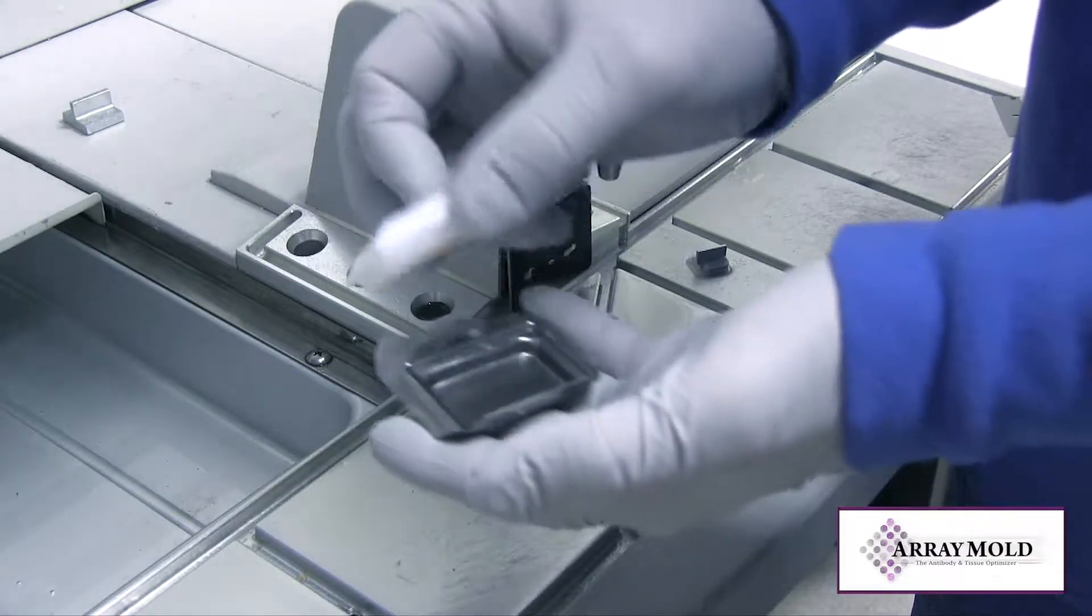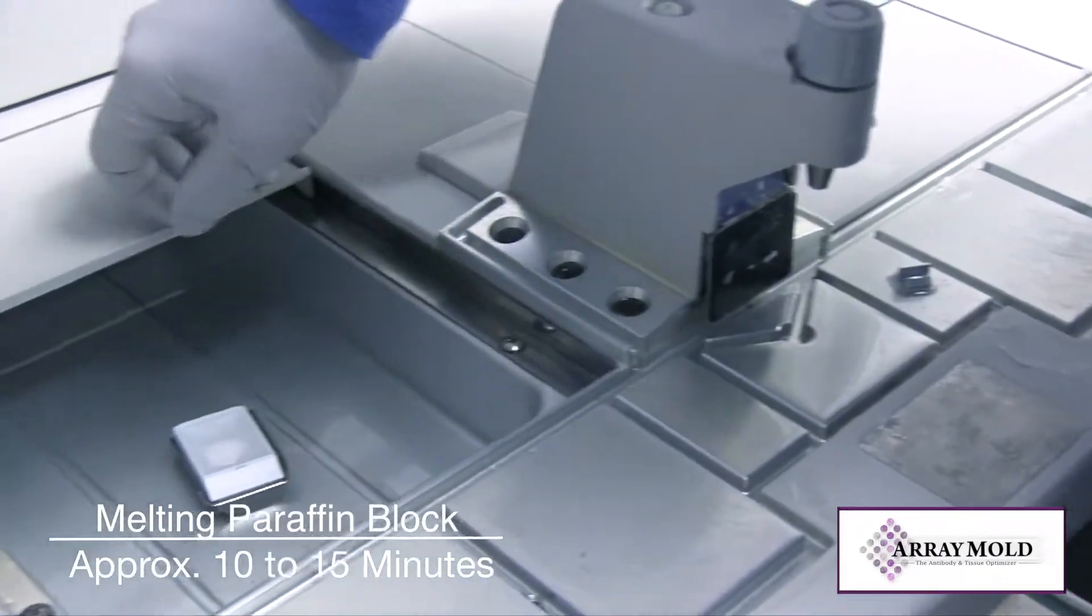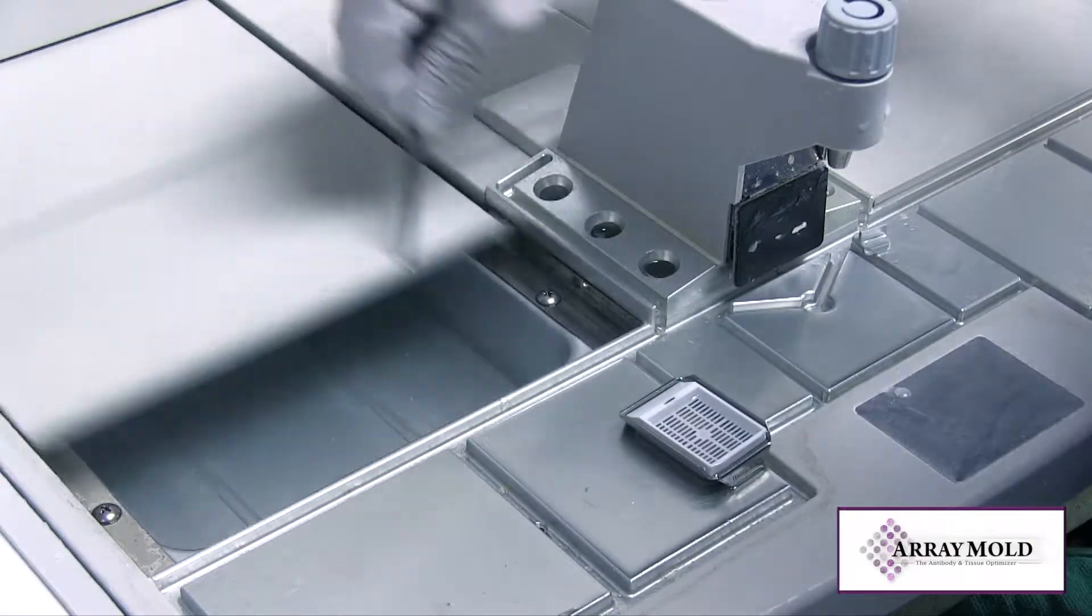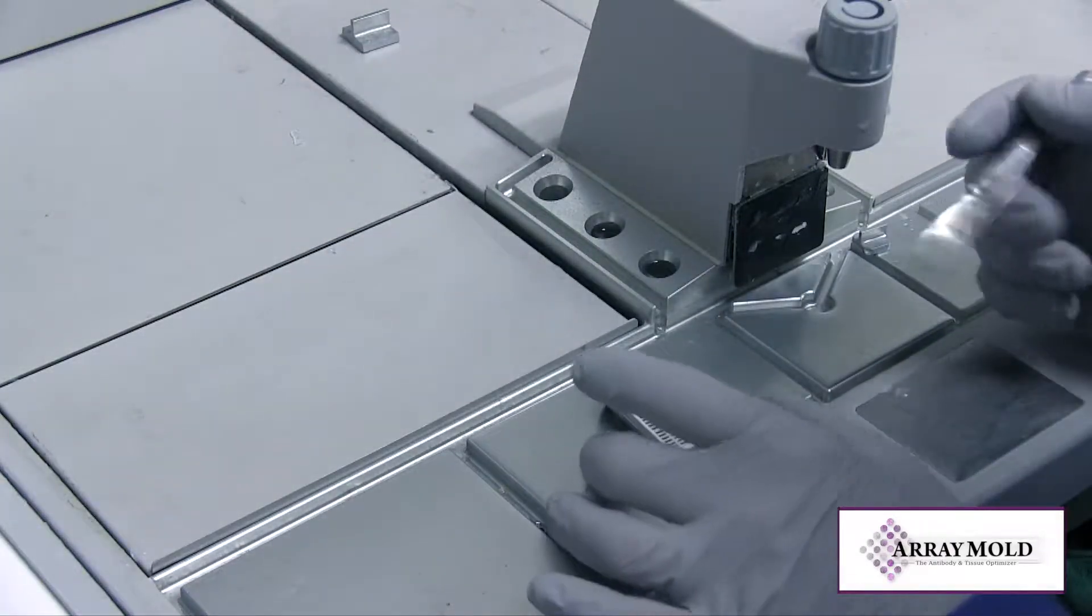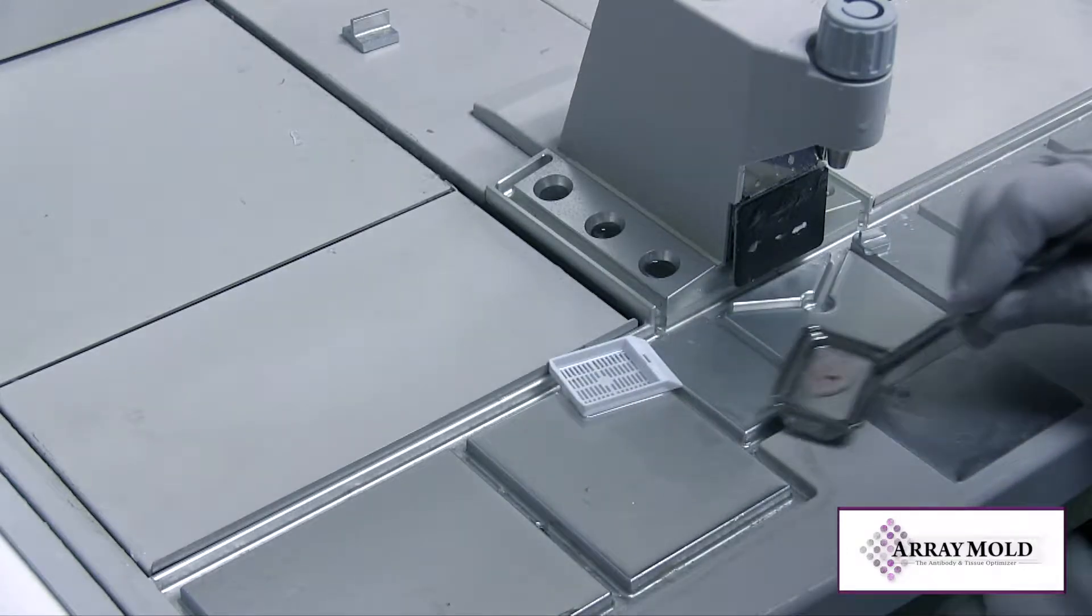The normal process: the paraffin block is melted down. This is necessary if the block has been chunked out while sectioning or cracked and damaged in some way that requires a total re-embed. This procedure normally takes anywhere between 20 and 30 minutes before the paraffin block is cold enough to be re-cut.